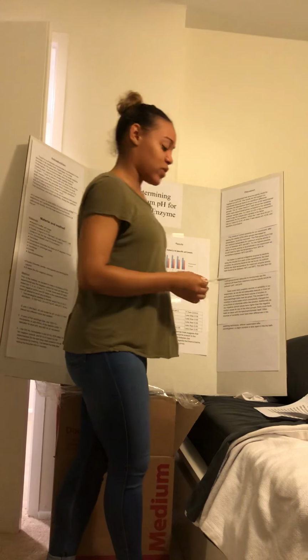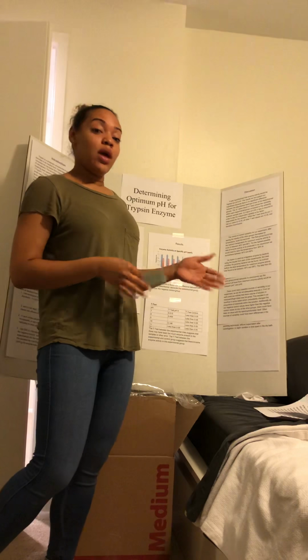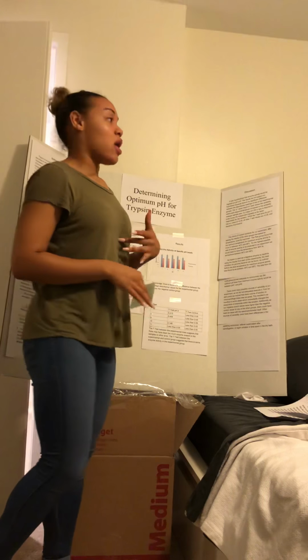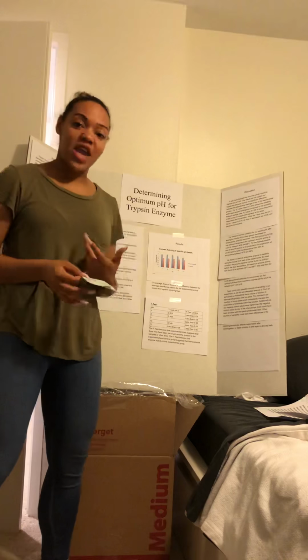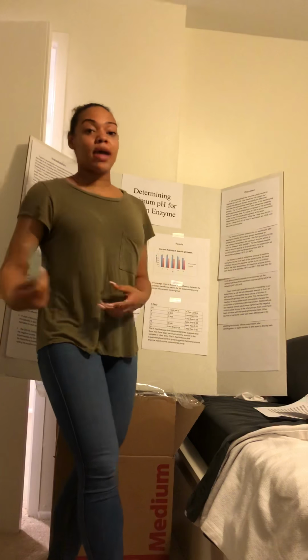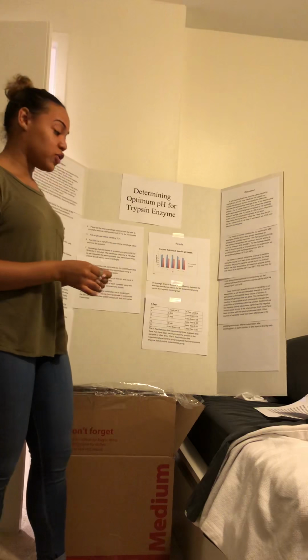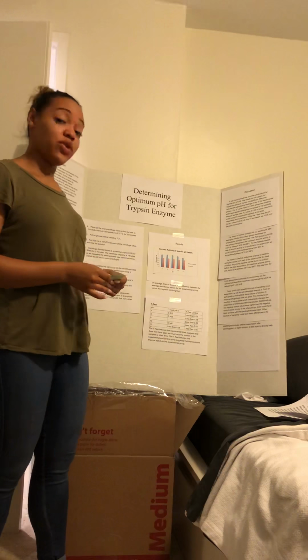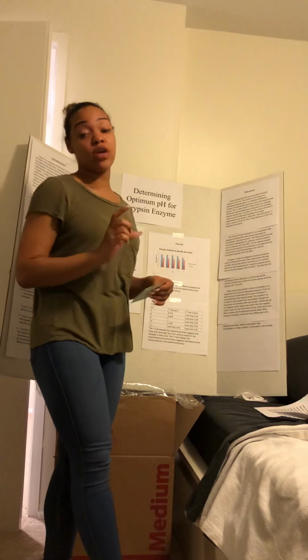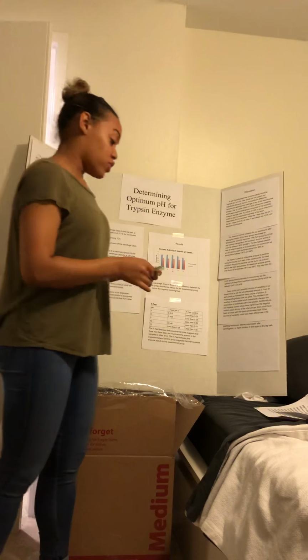Again, that's what the centrifuging is going to do after adding the TCA. The TCA is going to break down everything that was in that reaction, and then the centrifuge is going to clearly separate what was catalyzed and what was not. So centrifuging happened after making sure that the spectrophotometer was set to read 440 nanometers, and after blanking it with distilled water.